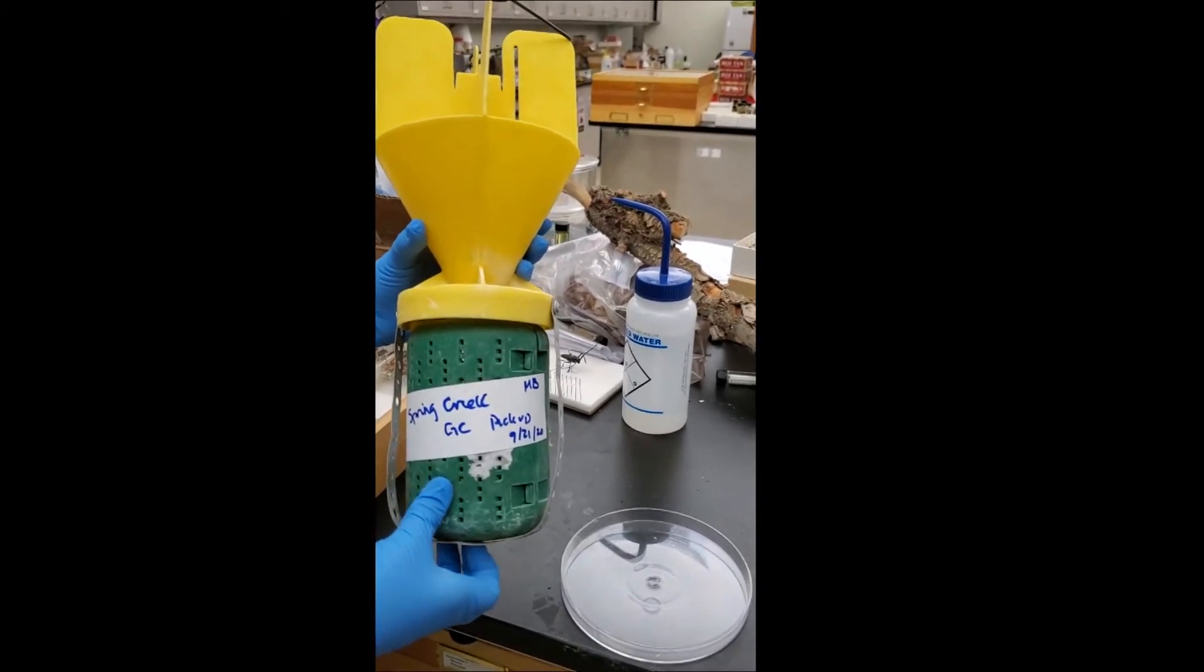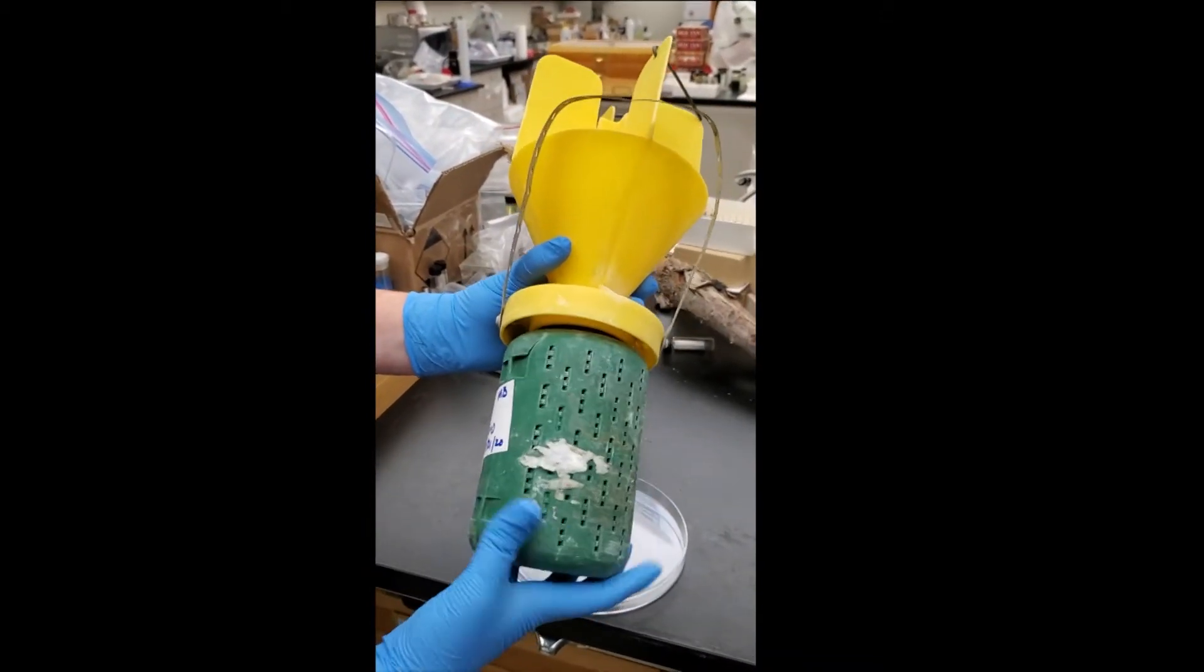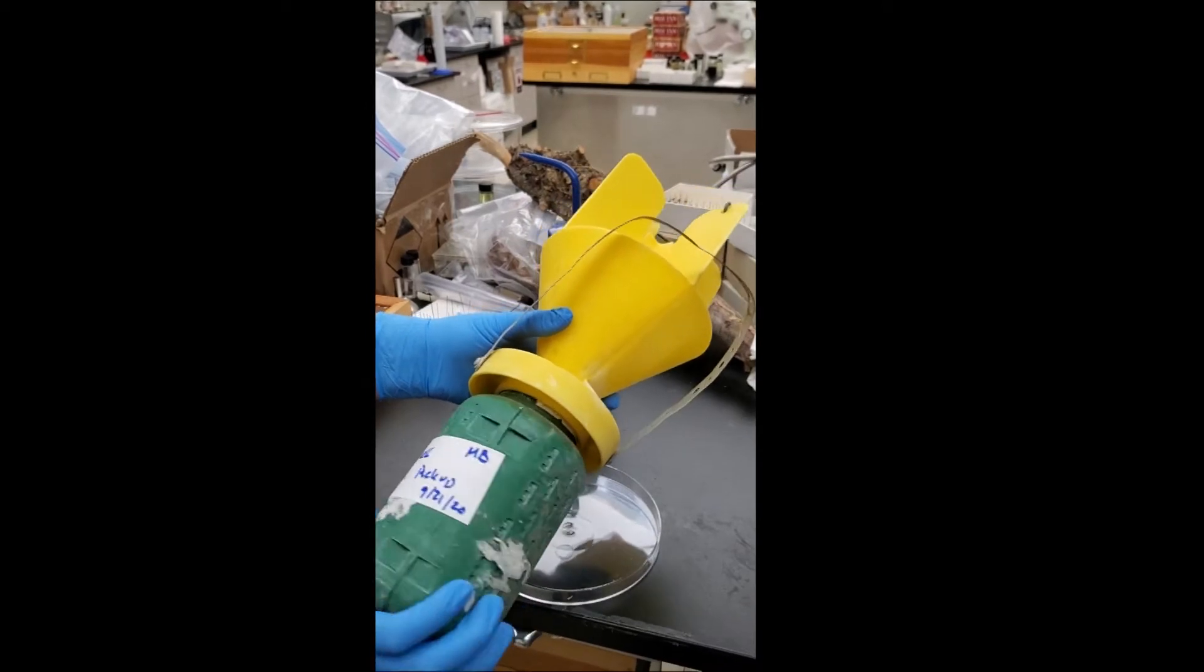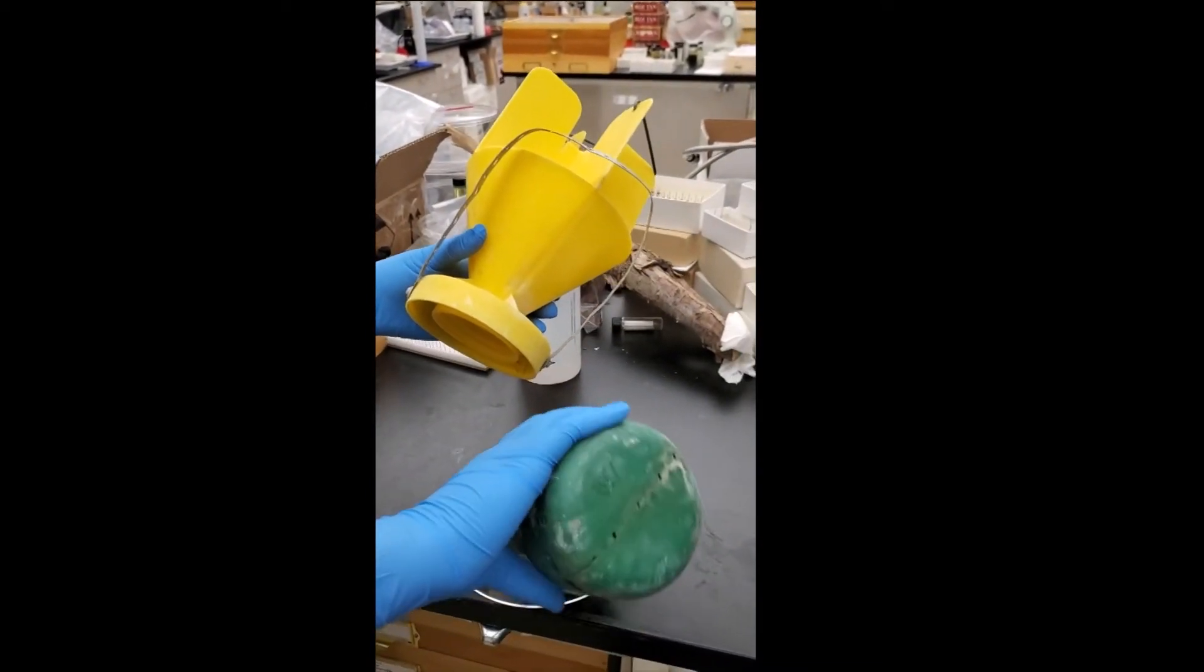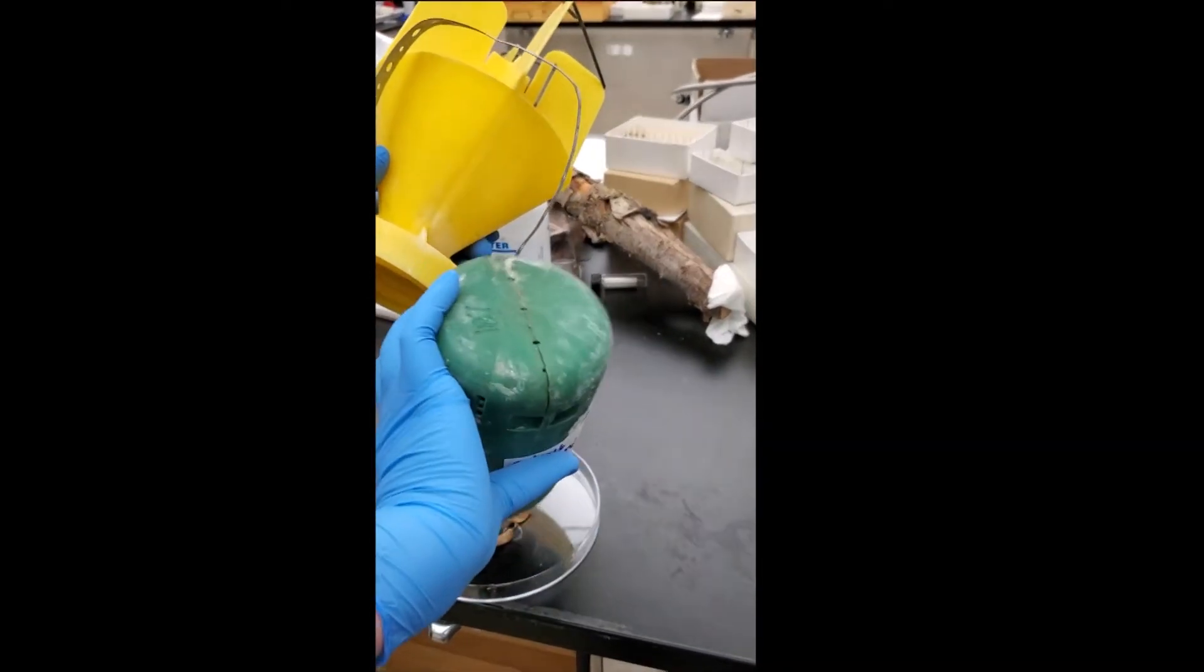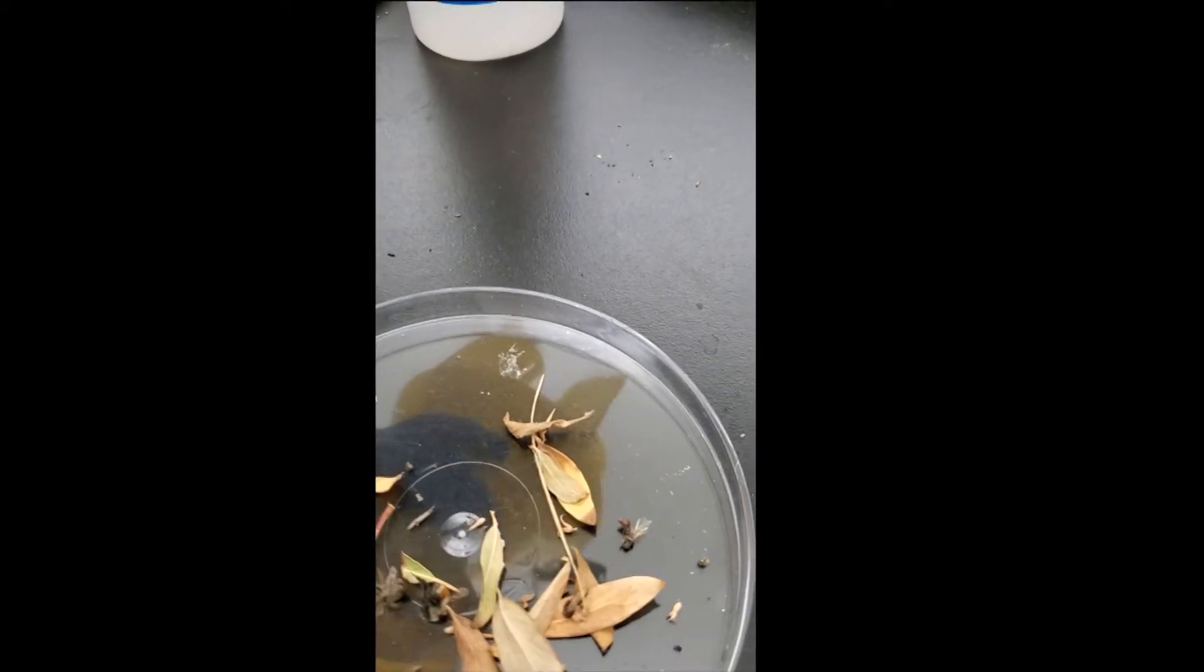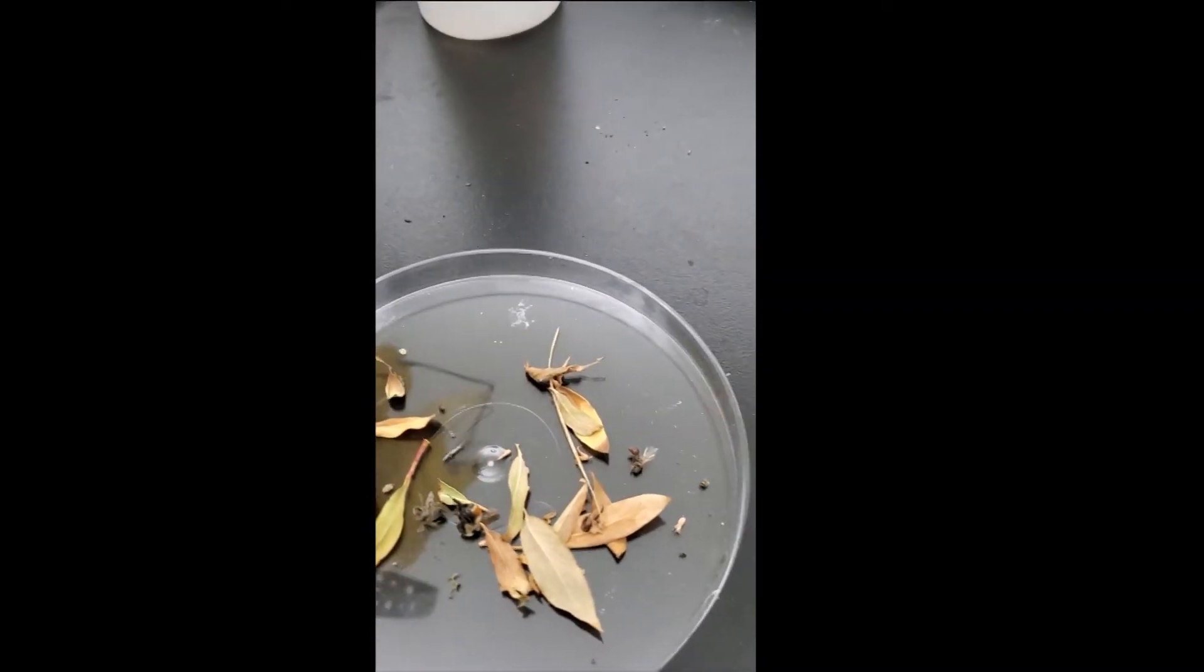You can see that we open the trap up. We dump out the contents to see if we've caught any of what we're looking for. And you can look in here. And we can take a look and see what we've got. And we can look real quick here and see that there's no Japanese beetles.